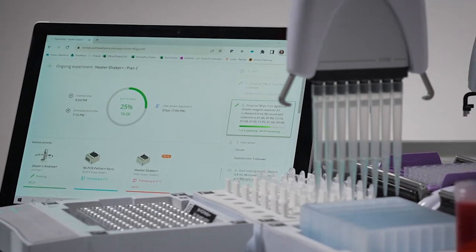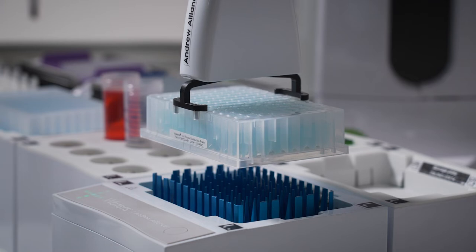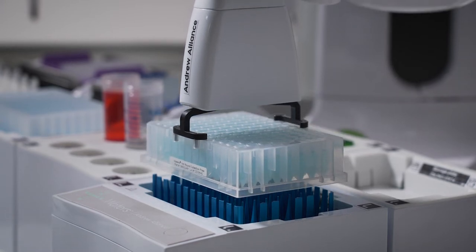So, how can the Heater Shaker Plus be integrated into one of your workflows? And what are the benefits? First, this device provides excellent performance and flexibility in a very small footprint. Thanks to its smart preheating capabilities in conjunction with OneLab software, it can begin heating at the optimal time and trigger plate movement once the desired temperature has been reached.